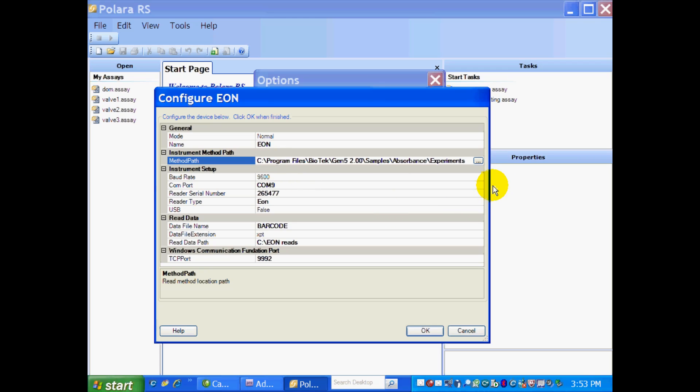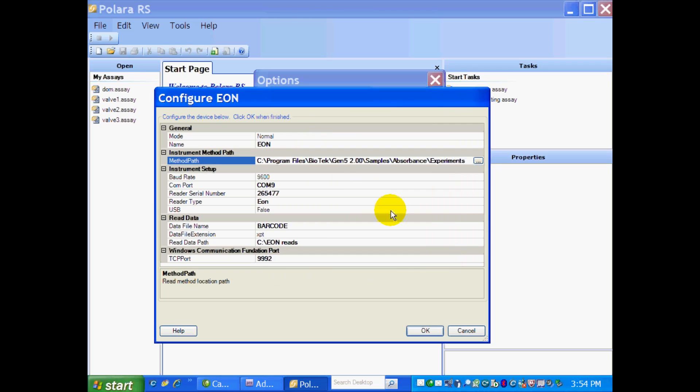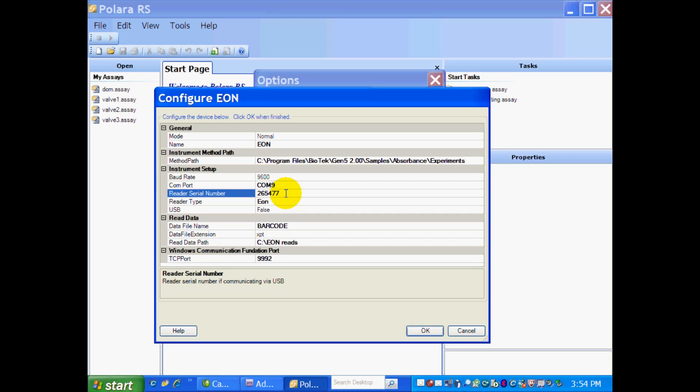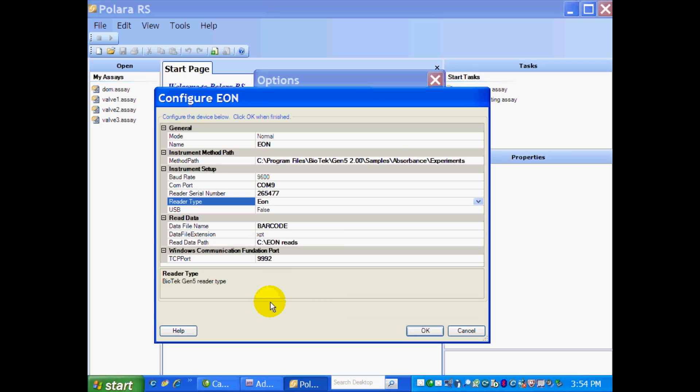If you need to change this path, you just click on the box here with the three dots. And you can change that to wherever you have your experiments saved. You have to identify the COM port. And I'm on COM9. You have to type in your reader's serial number. And then select your reader type from the drop-down just to confirm. And again, I'm on an Eon reader.